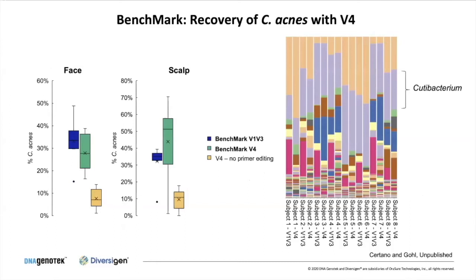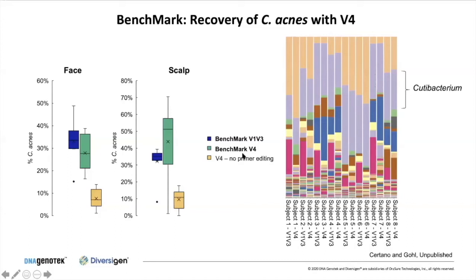We've seen primer editing rescue other taxa as well — for example, a particular TM7 taxon in a primate microbiome study that also has a mismatch to V4 amplification primers recovers specifically when we incorporate primer editing. This has been extended to the skin microbiome in work done at Diversigen by Amanda Stratano. For a variety of different body sites, incorporating primer editing with proofreading polymerases rescues detection of C. acnes to levels similar to V1-V3. Paired donor samples analyzed with V1-V3 or V4 show very similar levels of Cutibacterium when using V4 as long as these optimizations and primer editing have been implemented.